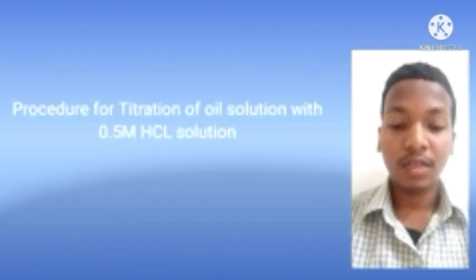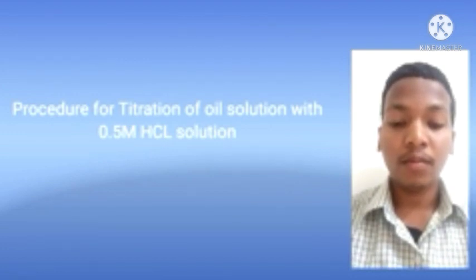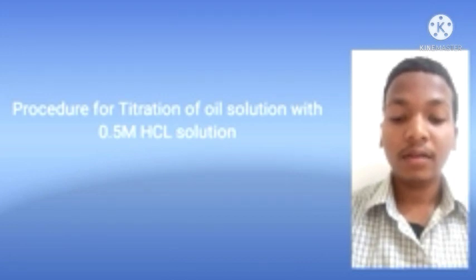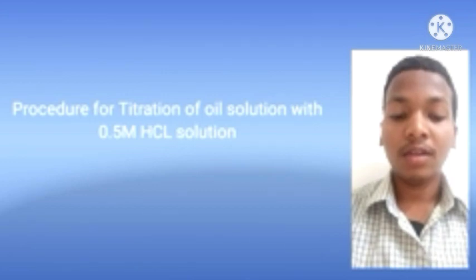Procedure for titration of oil solution with 0.5 molar HCl solution. First step: take a round bottom flask and take 1 gram oil in it. Add 25 ml ethyl alcohol using pipette.